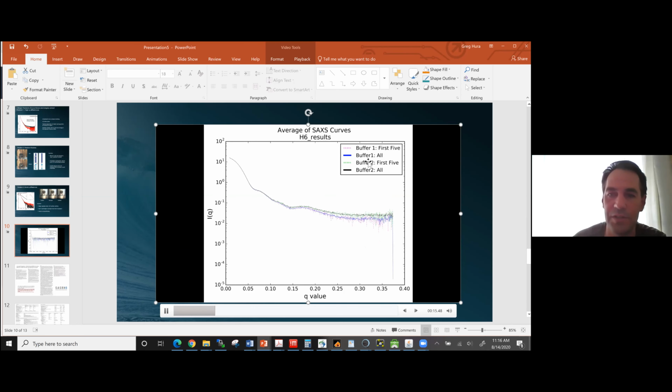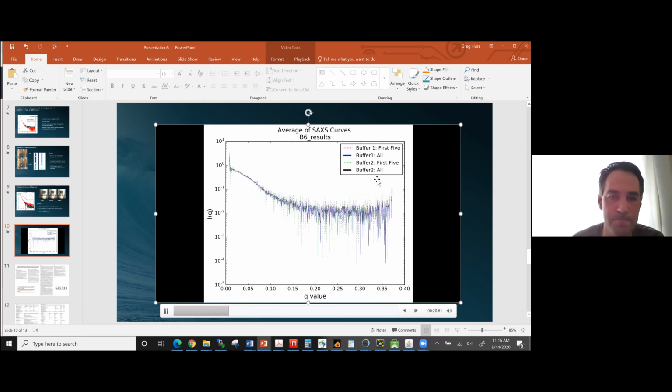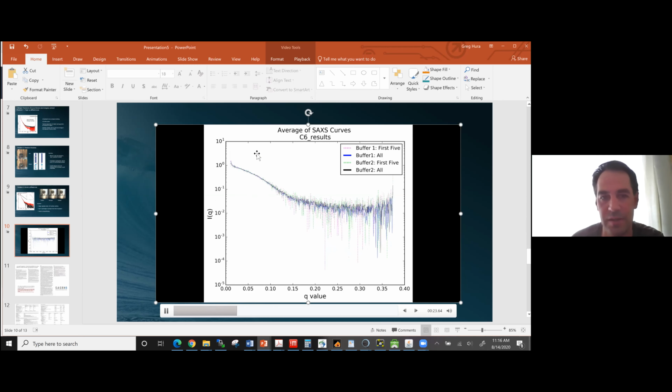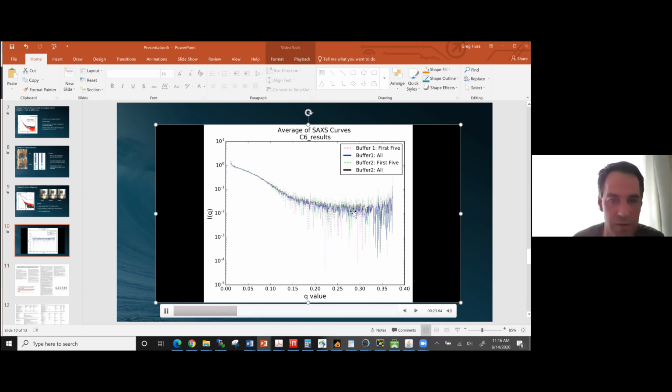And if you average all of the things merged together, those are the solid lines. So you get a sense of the issues of your data collection by scanning through those. And you see sometimes you get the high Q problems in certain ones, and sometimes you see small Q problems in certain ones as well. But hopefully for you, you got good agreement throughout.